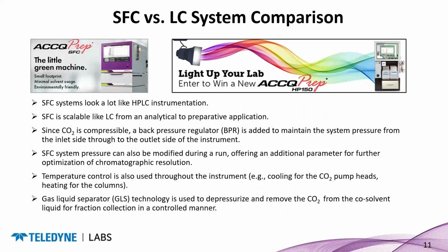So again, instrument-wise, SFC looks very much like LC. You can see our AccuPrep SFC was designed to be a very compact system, much like our HPLC to the right. It's scalable just like LC from analytical to prep. I like to oversimplify it by saying you're doing HPLC with carbon dioxide as a solvent, although there's a little more baked into the engineering on the instrument.